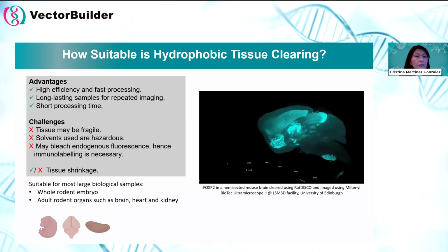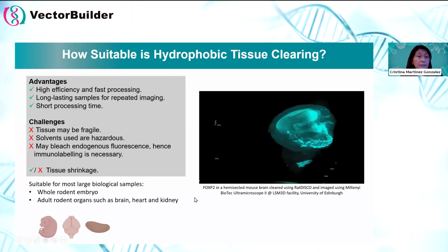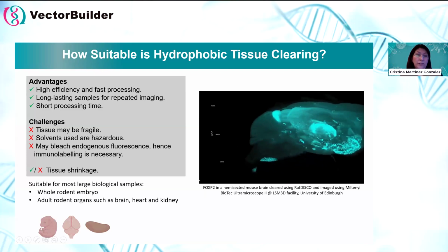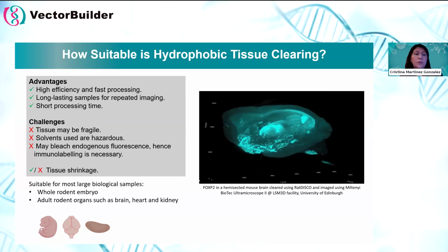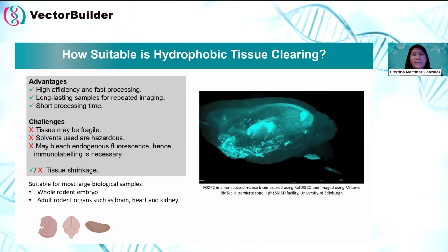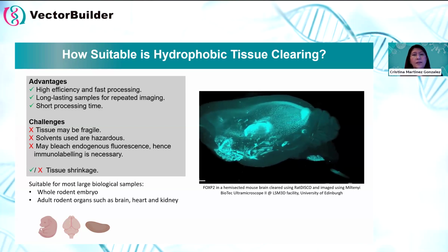So for this, I would say this method is suitable for large biological samples, whole embryos, whole mouse, large brains, hearts, etc., kidneys, the whole structures.